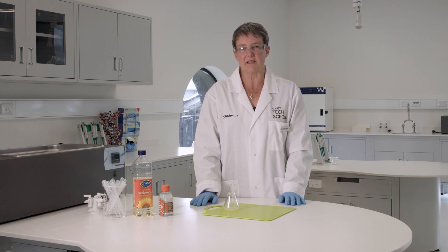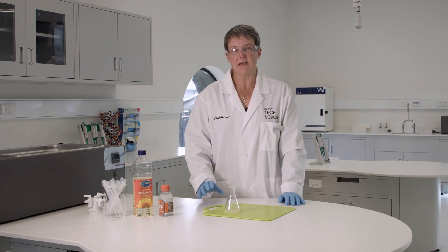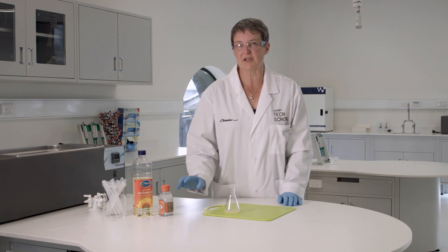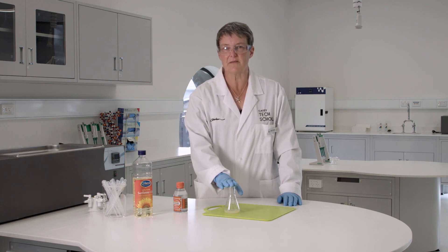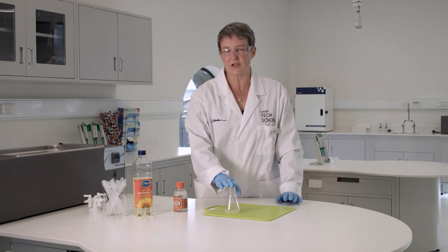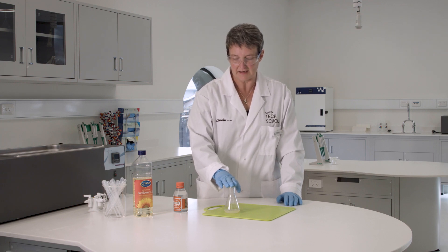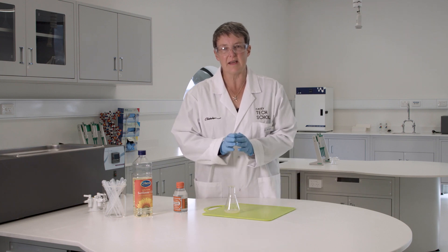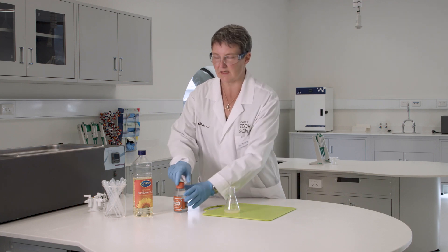Those esters are actually the biodiesel. We've got it all sitting in there, and if I left it sitting it would slowly separate out. But I can speed up that process by seeding it with extra glycerol. If the reaction has gone to completion, I should have my fatty acid esters and glycerol already in there, but that glycerol will be mixed through really evenly. I need to get all those glycerol molecules to gather together so they will sink to the bottom much faster. To do that, we'll seed it with glycerol.